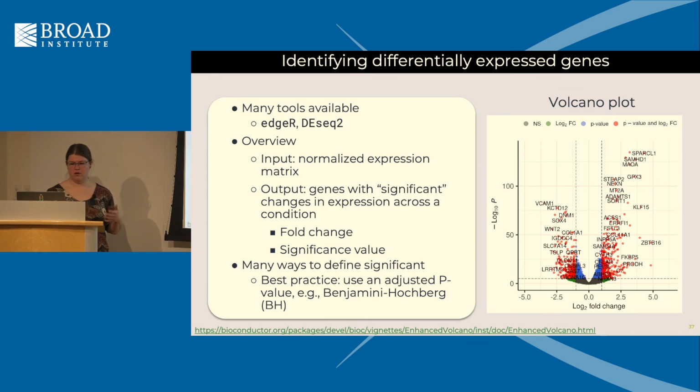Hochberg p-value of multiple testing correction. I'm showing you a really beautiful volcano plot on the side. I just think that this person who wrote this R package, EnhancedVolcano, made a really nice plot. It works inherently with the objects that come from DESeq2, and it gives you a sense of where your cutoffs are for your log2 fold change, and where your cutoffs are for p-value for significance.